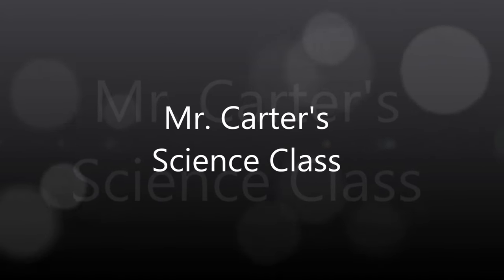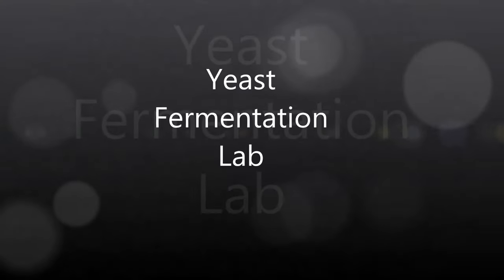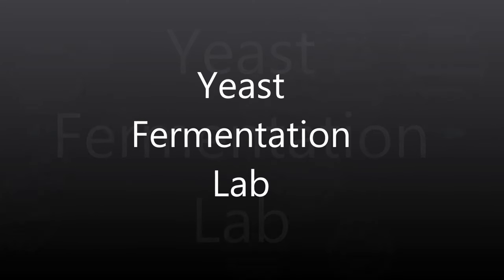Mr. Carter here back for another video. Today in my science class we're going to look at the fermentation of simple sugars by yeast.